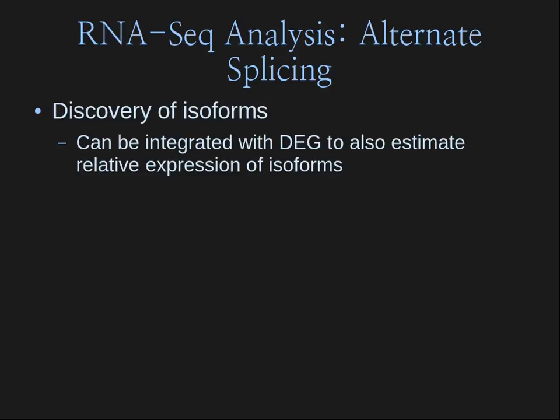The thing that you really need for this is there's only a certain number of these transcripts that are actually useful for informing you about the different levels of these isoforms. And those are the ones that cover the intronic region that was cut out. So right here, probably this one, this one, this one.